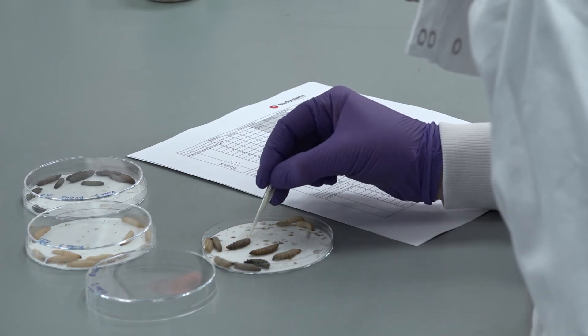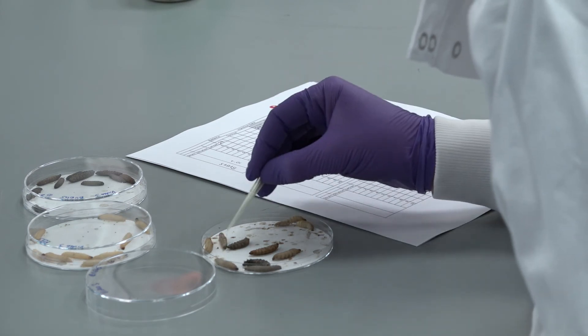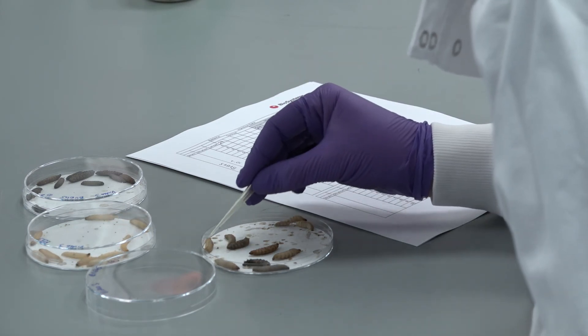To dispose of larvae, place in a minus 20 degree freezer overnight before autoclaving with other biological waste.